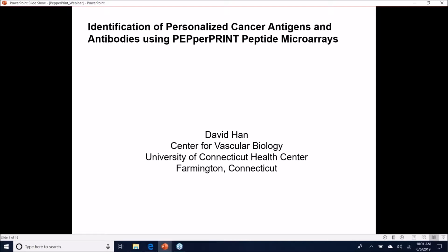He is interested in utilizing proteomics and systems biology approaches to identify cancer biomarkers. His group has developed a method termed Genomics-Driven Immunoproteomics, or GDI, which utilizes high-density peptide microarrays to identify breast cancer-specific tumor antigens and antibodies that recognize these antigens. The eventual goal is to develop multi-targeted anti-cancer therapeutics using the GDI approach.